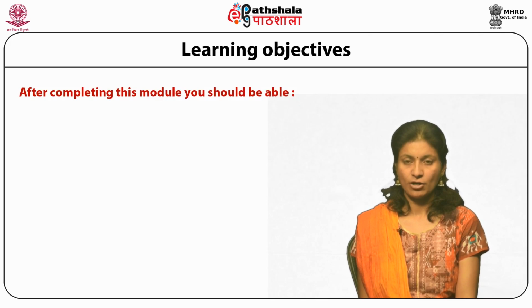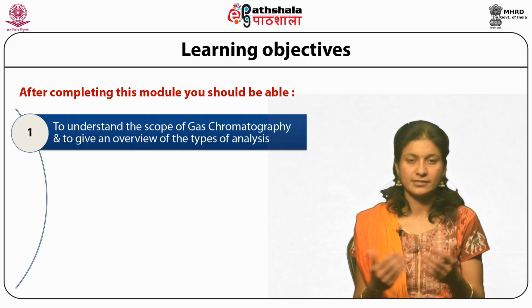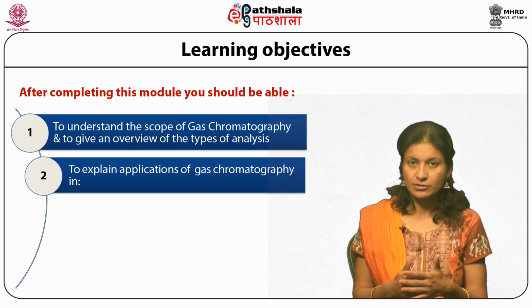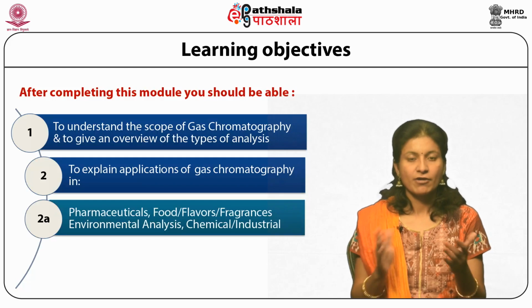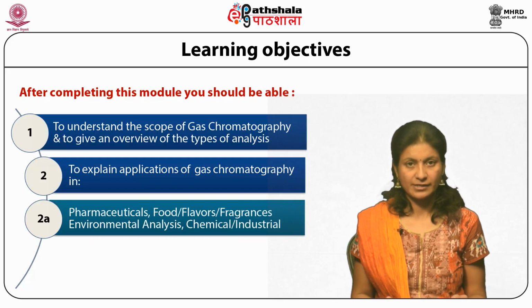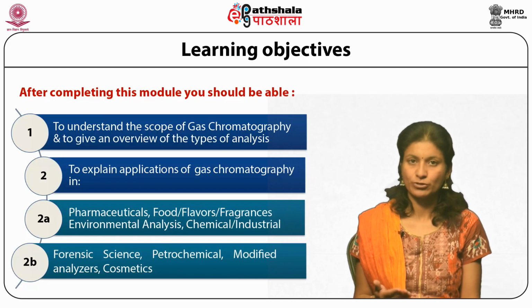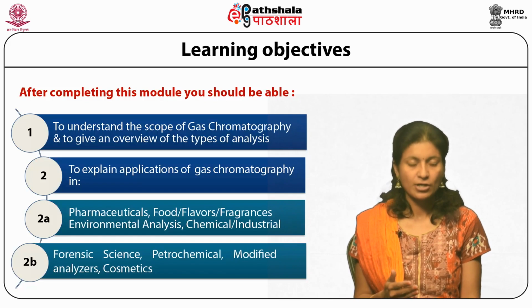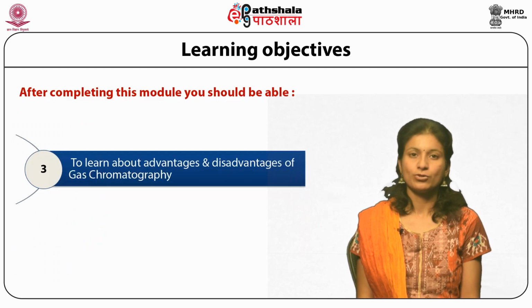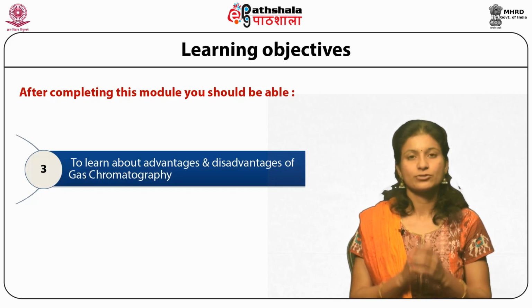The learning objectives of this module are to understand the scope of gas chromatography, to give an overview of the types of analysis, to explain applications of gas chromatography in pharmaceuticals, food, flavors, fragrances, environmental analysis, chemical, industrial, forensic science, petrochemical, modified analyzers, cosmetics, etc., and to learn about advantages and disadvantages of gas chromatography.